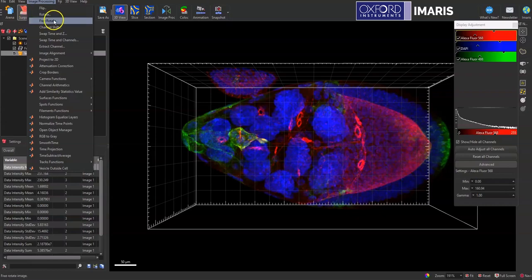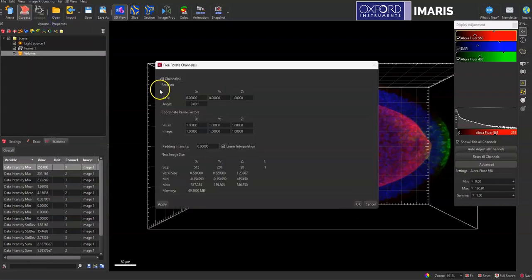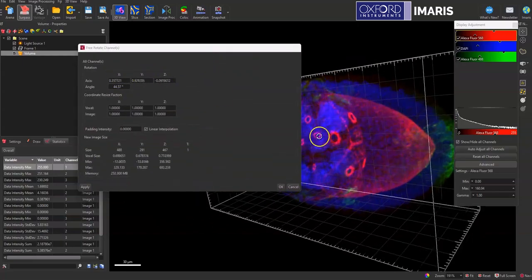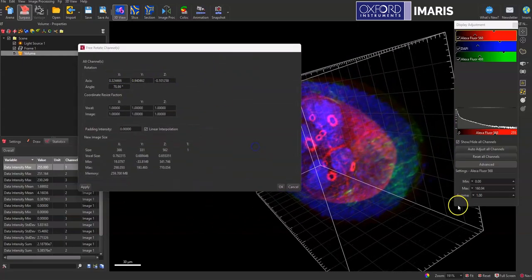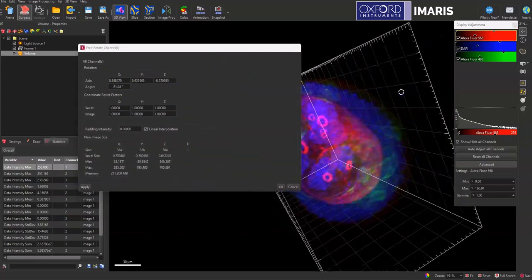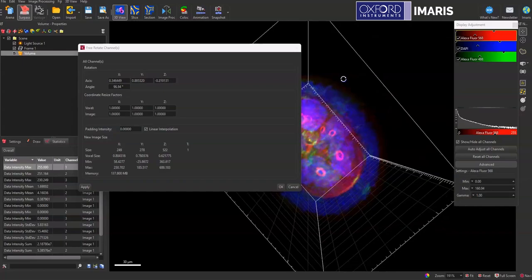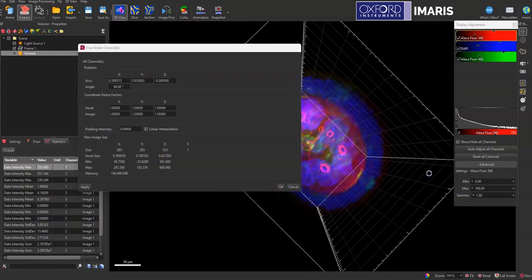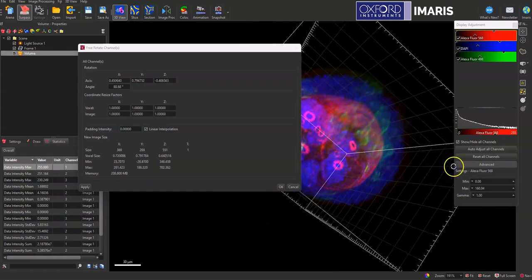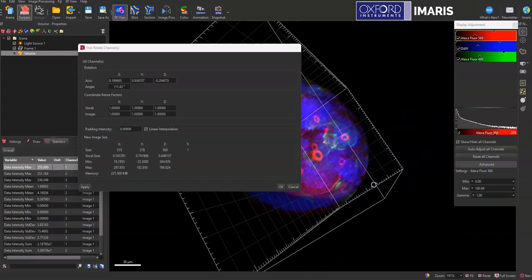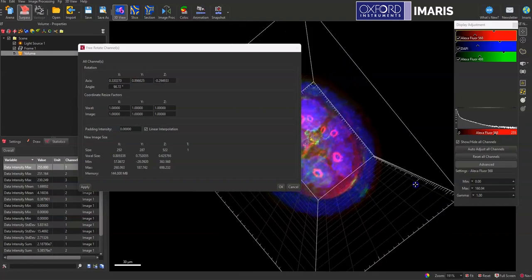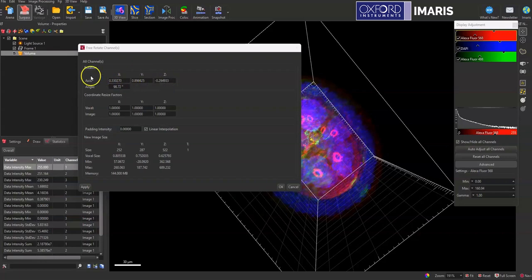And so this free rotate option here allows you to either type in the values or manually move your image to create the specific rotation that needs to be done so you can create that mock time lapse exactly as it needs to be, so you can either manually type those values in here.